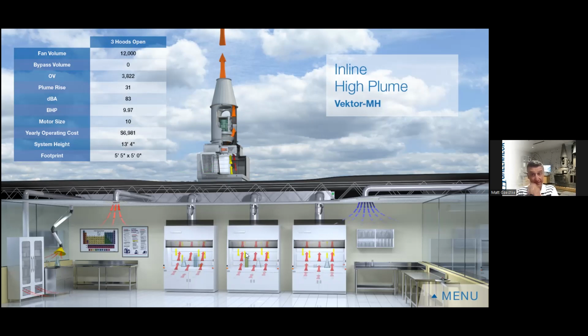Now, the last is the duct static pressure. If you've been observing when I've been opening and closing sashes, there's a little bright light here that has been turning from green to red, indicating a change. In my lab, green is good. That means my duct static pressure is appropriate to provide pull as needed when these sashes open, or when the sashes are closed, that there's not too much pressure drop in that duct.